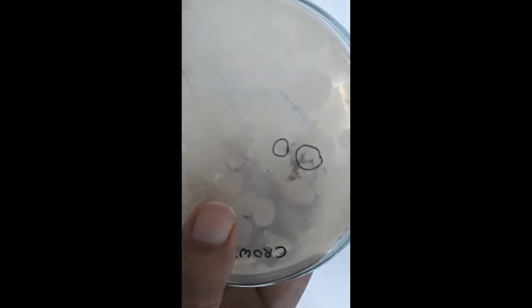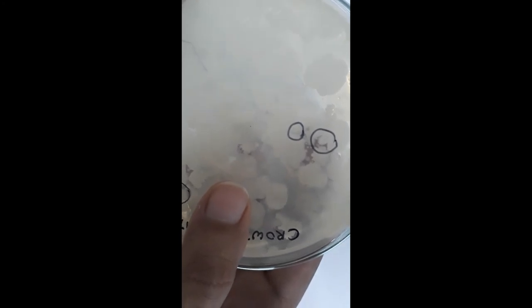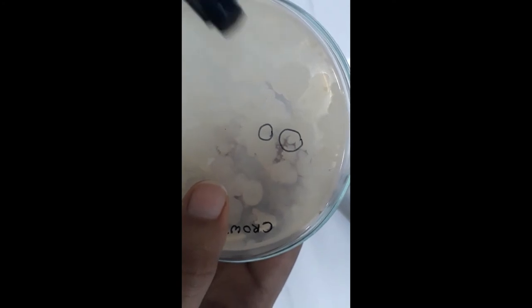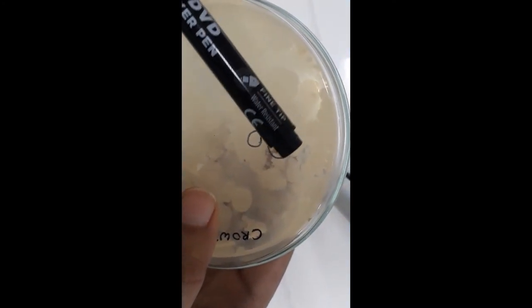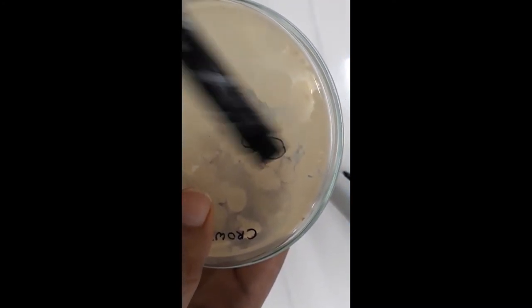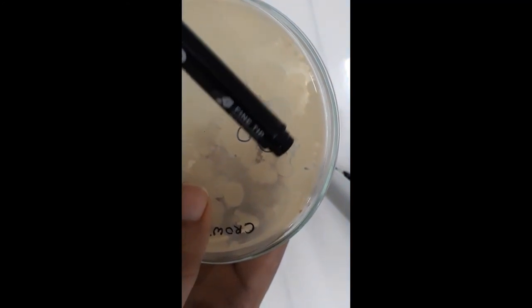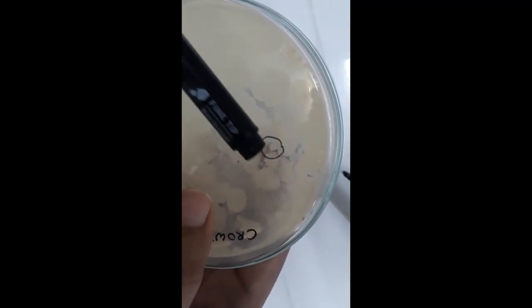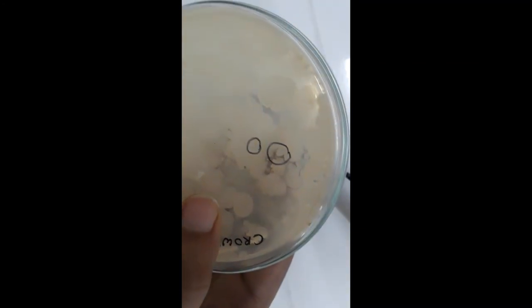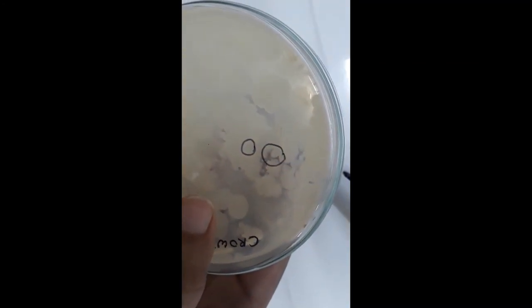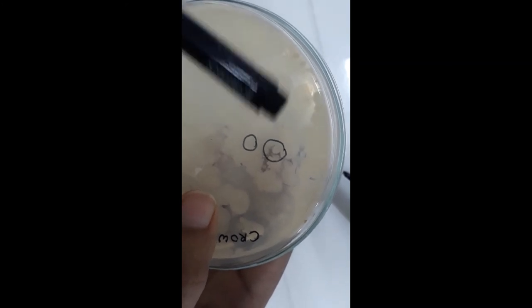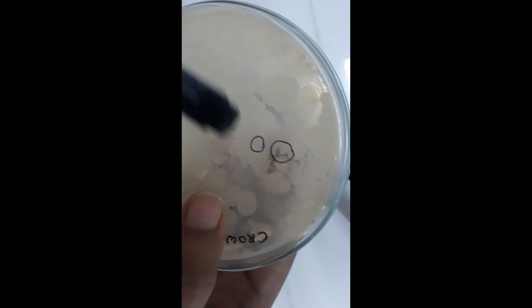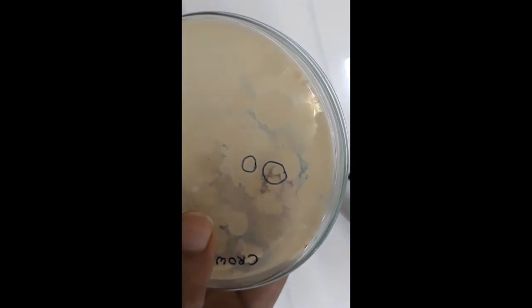What we are seeing here are the results of the crowded plate technique. As we can see, this central colony is pushing away other organisms and therefore a halo has been created here. This is because the central colony is producing certain antibiotic substances which are killing the other organisms and not allowing them to come near this organism.